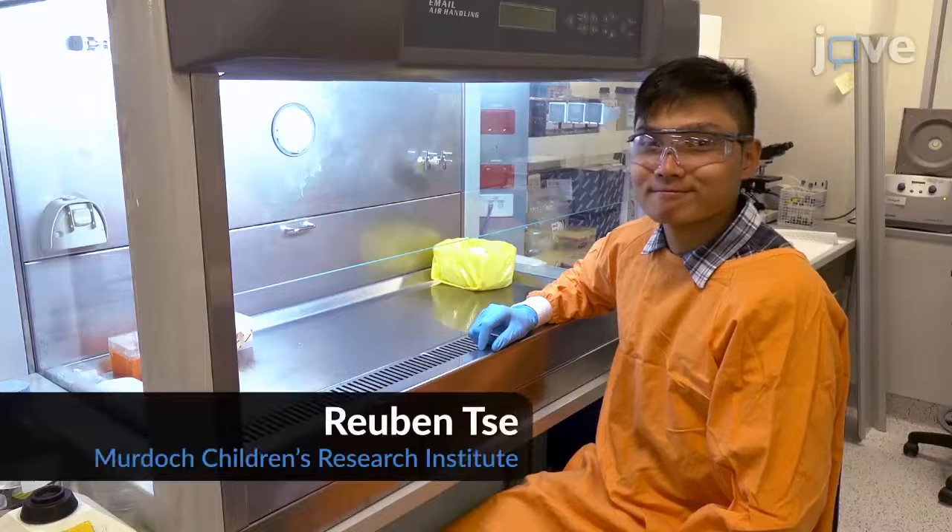We describe here an imaging-based micro-neutralization assay that has been tested on RSV subgroup A and can also be adapted for RSV subgroup B and different sample types. Demonstrating the procedure will be Ruben Tse, a member of the research team at MCRI.